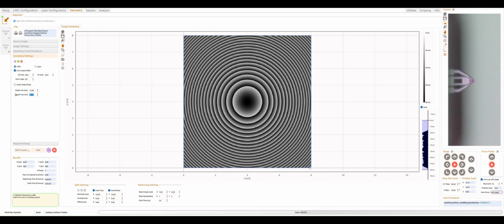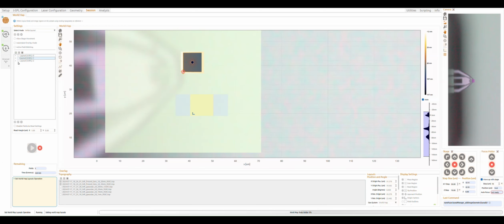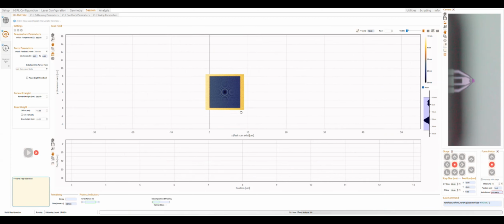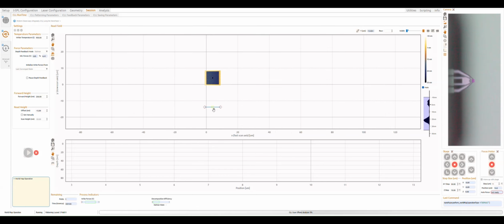Let's see what happens if I import a more realistic one. I would say 35 maybe should be done. I'm not 100% sure what will be displayed because I don't use the simulator often, but we can see together. But I assume that the profile is going to look a little bit better, even though it doesn't seem to be the case.